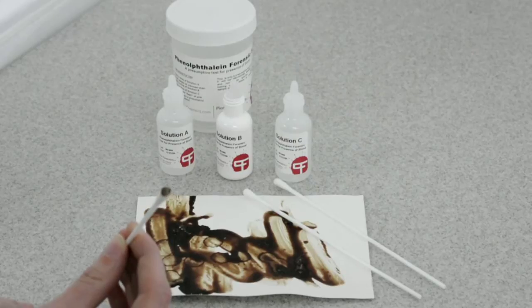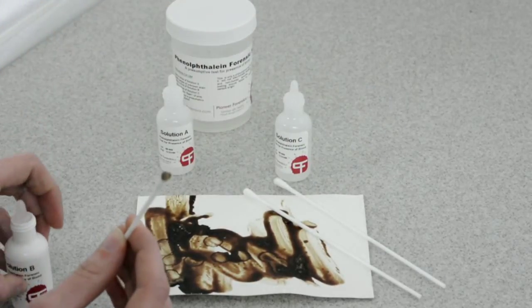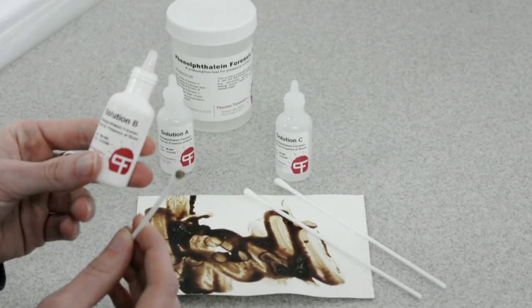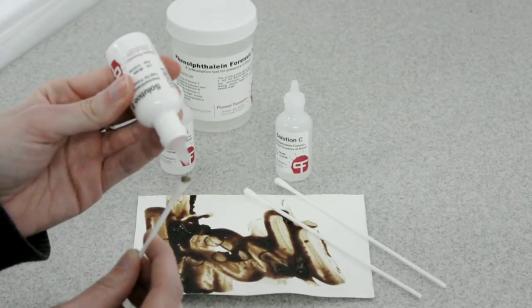Your suspect material will appear brownish on your swab, or reddish depending on the age of the stain. By applying Solution B, which is your phenolphthalein solution, you're going to get a slight washout of the color.